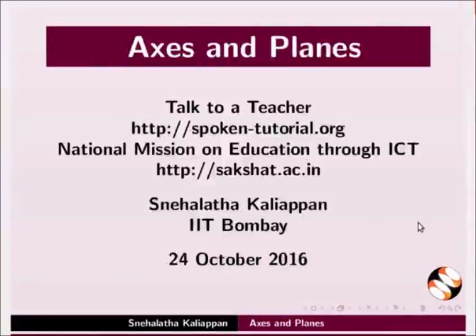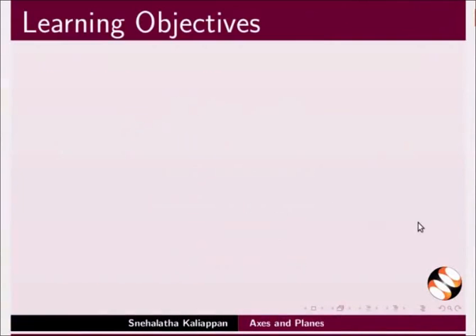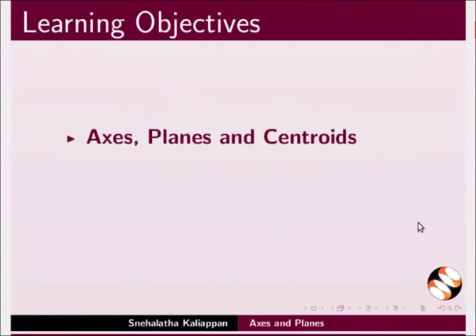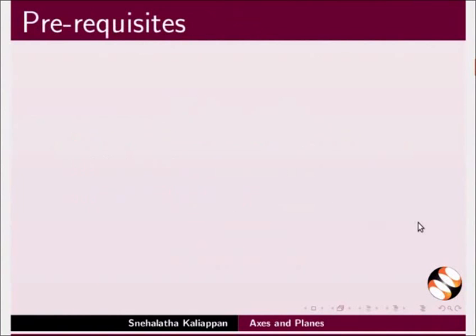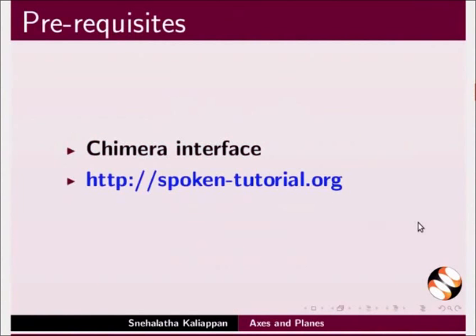Welcome to this tutorial on axes and planes using Chimera. In this tutorial, we will learn to show axes, planes and centroids, 2D labels and per model clipping. To follow this tutorial, you should be familiar with Chimera interface. If not, for relevant tutorials, please visit our website.